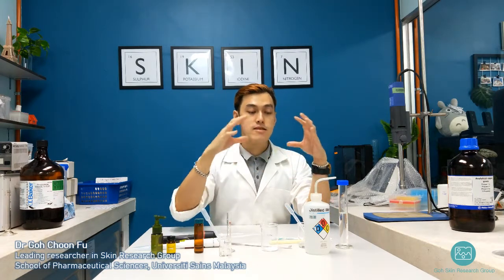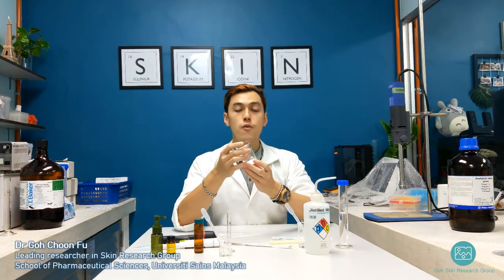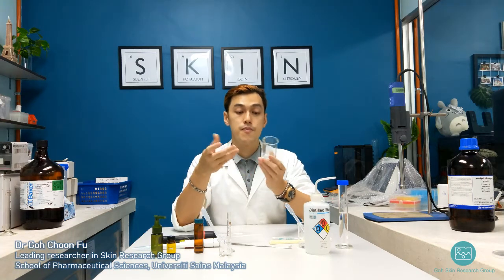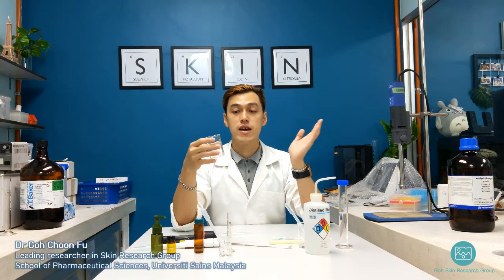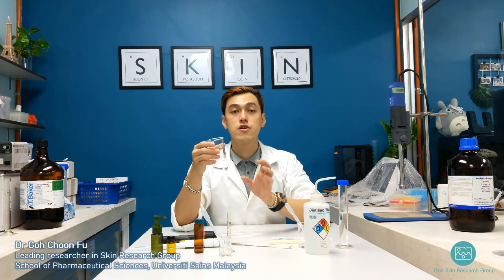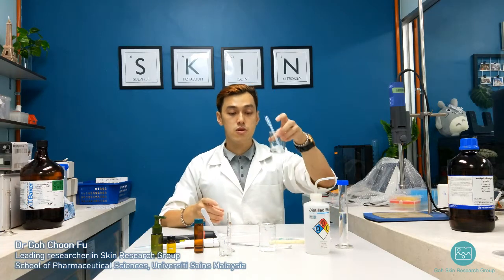As we are preparing a gel, we definitely need a gelling agent. Here we have a type of polymer that you can easily get if you have lab resources, or you can access any supplier to get the polymer. Here we use Hypromellose, or in short HPMC. And finally, we need water.